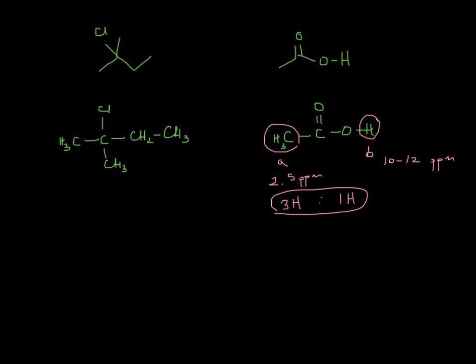All right, let's go on to the slightly harder one on the left. Here we've got a CH3, another CH3, a CH2, and a third CH3. Starting off to the right, this CH3 we'll call environment A. Obviously this CH2 is not going to be the same as anything else, so that would be environment B. The only thing we have to figure out is those two CH3s off to the left. Are they the same as A? Are they the same as each other? Or are they all by themselves?